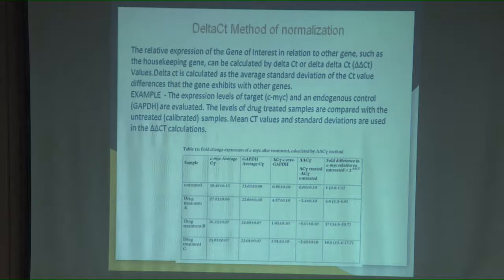Why have you found out differences? You are actually nullifying; I said to you, normalization. So, this is the process of normalization, you are subtracting in every case.